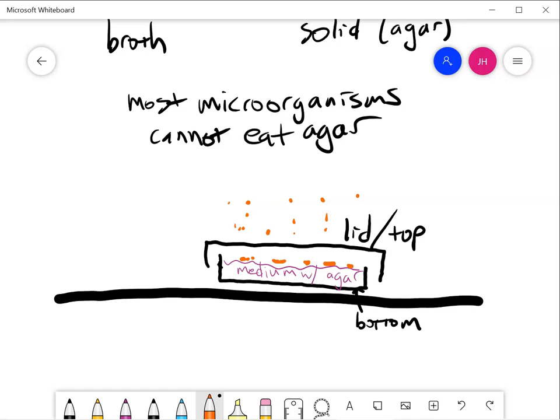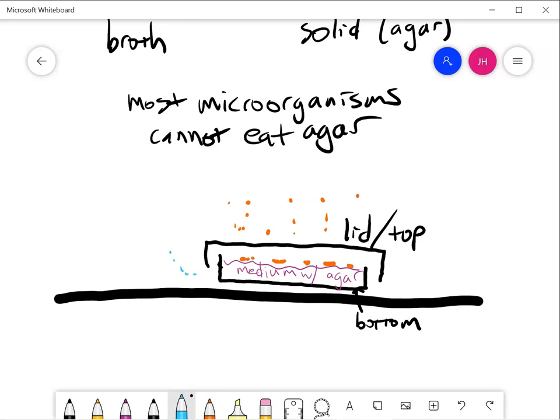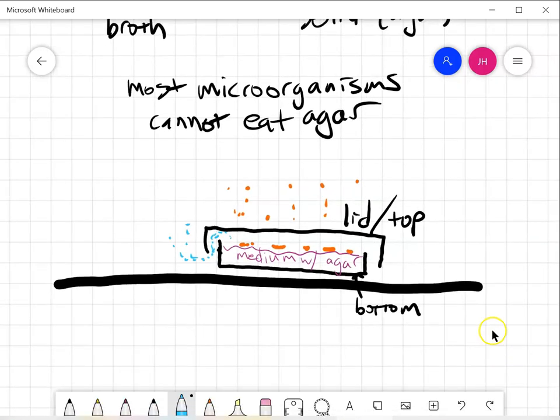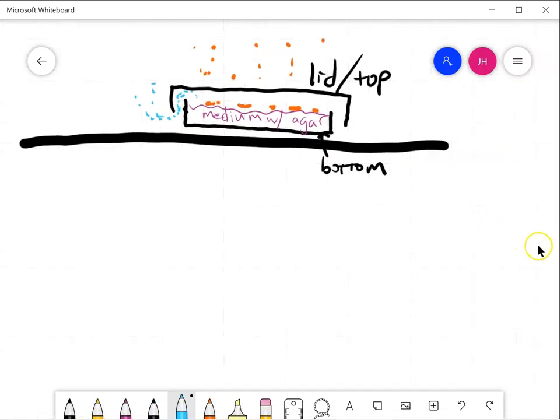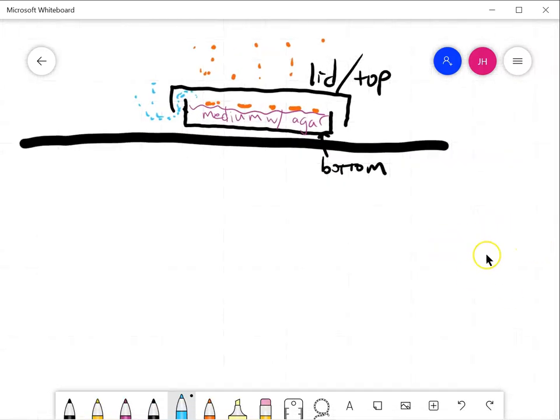This is like Pasteur's swan-necked flask because air can get in. So these cells growing in here have access to air and their waste gases can get out. But there will never be any growth unless we put cells in there.